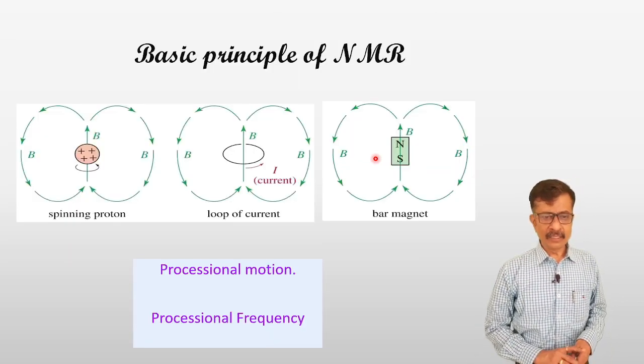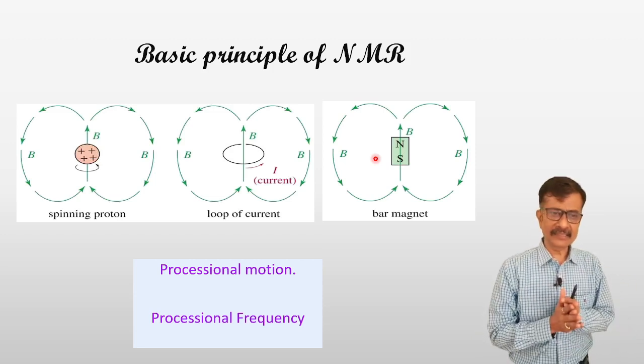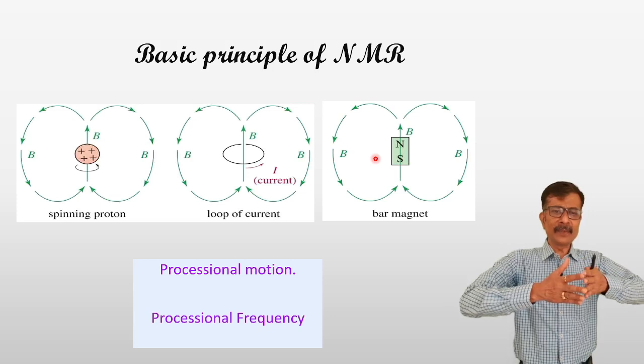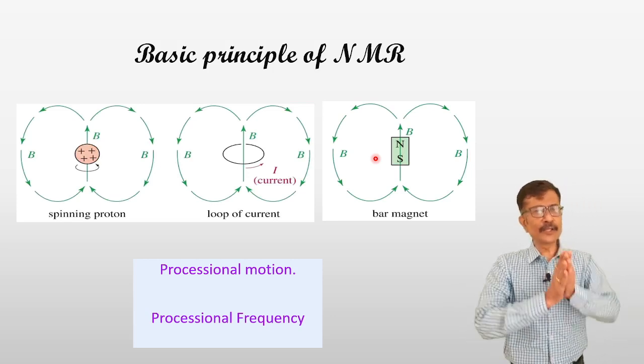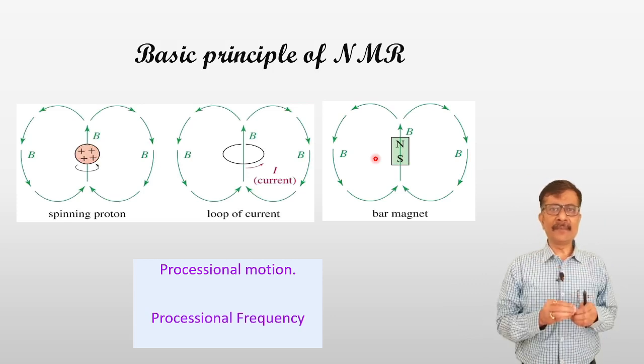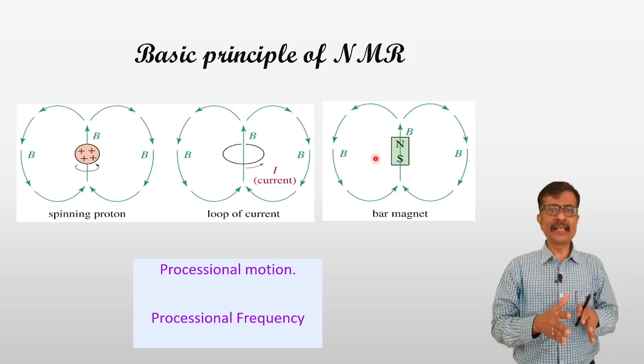Now, how does this phenomenon take place? What is the principle on which NMR is based? As I already told, in NMR the nucleus of an atom is involved in the absorption.